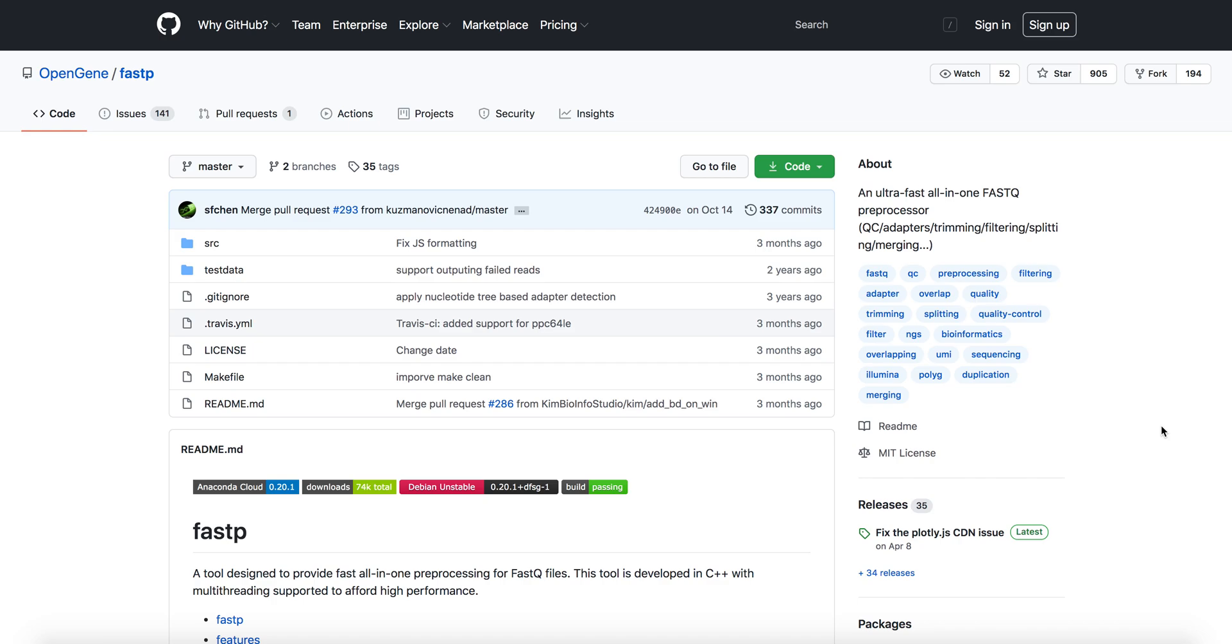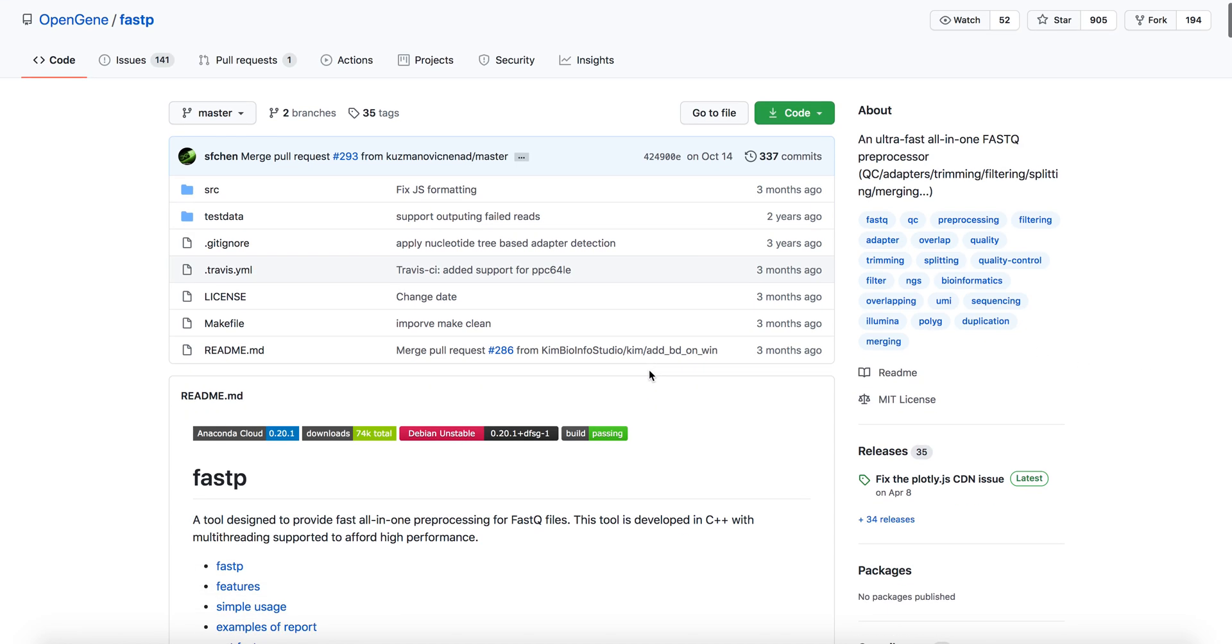It combines a lot of different functionalities. As you can see, quality control, adapters, quality trimming, filtering, etc., as you need.